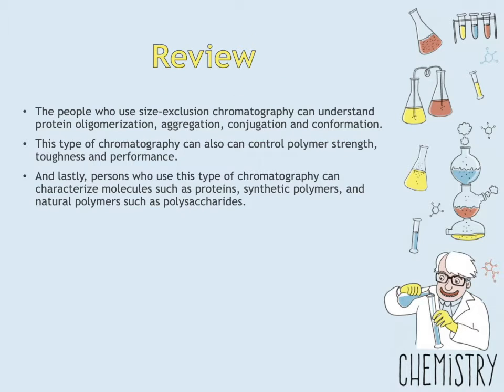Next, we also know that people who use size exclusion chromatography will be able to understand protein oligomerization, aggregation, conjugation, and conformation. One of the reasons also that analysts use size exclusion chromatography is because they can control polymer strength, toughness, and performance. And lastly, persons who use this type of chromatography can characterize molecules such as proteins, synthetic polymers, and natural polymers from each other, so they can differentiate also.